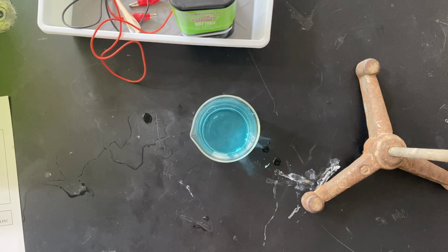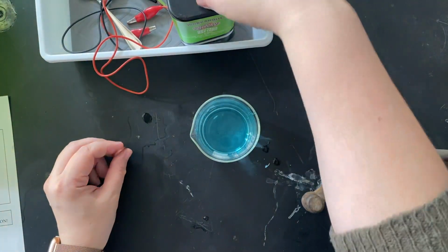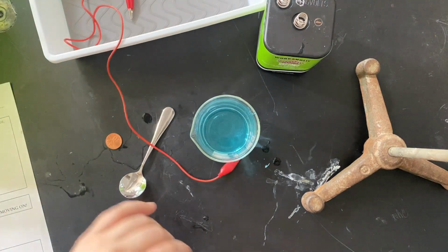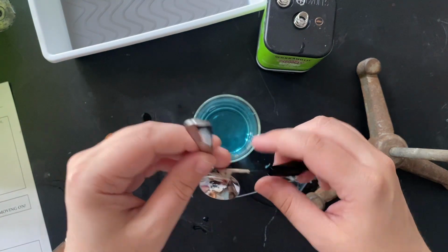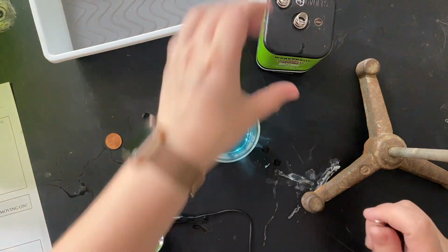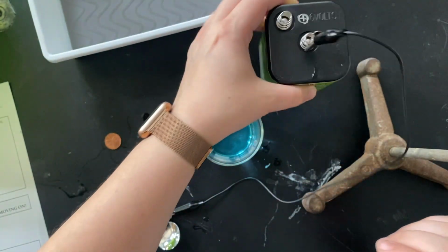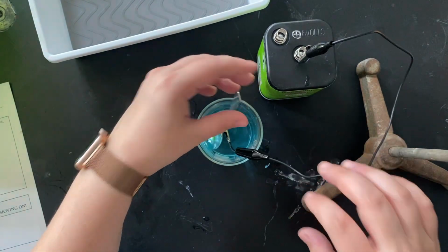Okay. Your next step is to get a penny if you don't already have one, but they should be in your little bin. And so, with your penny and your spoon, next step says clip one end of the black wire. So, black wire onto your spoon, clip it towards the bottom, that will help later on. And then the other end of the black wire to the negative part of the battery. So on your battery, you have the positive, which is this little spring, and the negative, which is this one. So you're going to connect your spoon to your negative. Then it says place the spoon and submerge it into the copper solution, just like that.